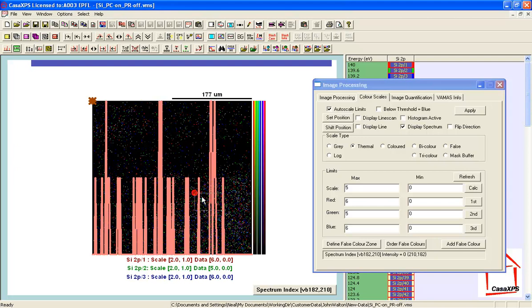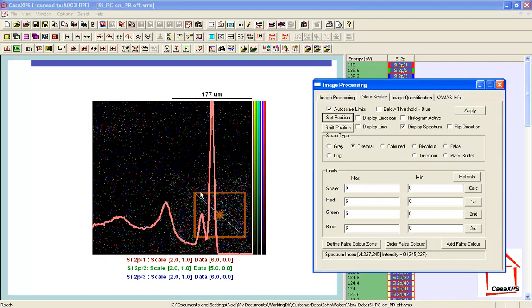There is an option that allows the integration of pixels over an area. I've marked a box, and when I press set position, each pixel within this box is integrated in terms of the spectra, and the sum of all these integrated pixel spectra is plotted over the image. What we see is a typical spectrum from a silicon wafer with a small amount of oxide on the surface — thin oxide on elemental silicon. We know this is elemental silicon because of the plasmon structure, which is very typical of elemental silicon. These two peaks represent different oxidation states of silicon.